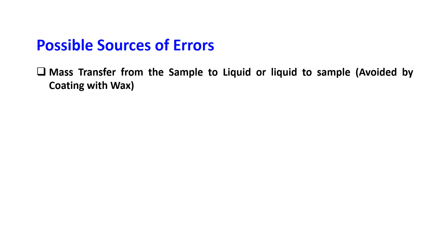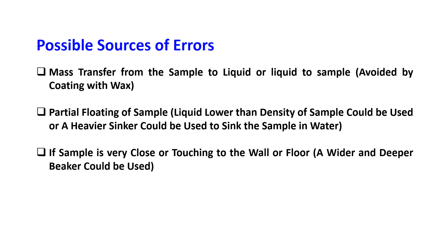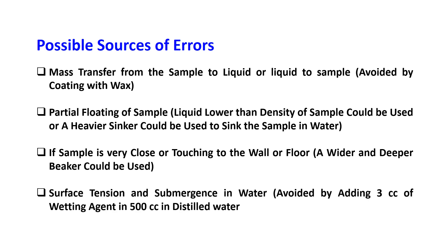Possible sources of error are: mass transfer from the sample to liquid or liquid to sample — this can be avoided by coating with wax. Partial floating of the sample — a liquid with lower density than the sample could be used, or a heavier sinker could be used to sink the sample in water. If the sample is very close to or touching the wall or floor, a wider and deeper beaker should be used. Surface tension during submergence in water can be avoided by adding 3 cc of wetting agent in 500 cc of distilled water.